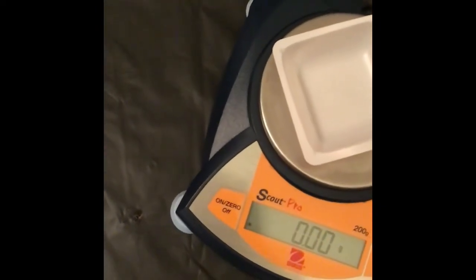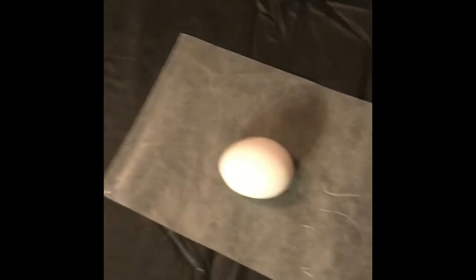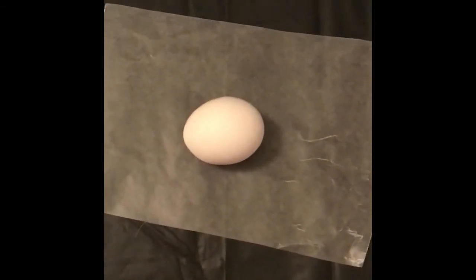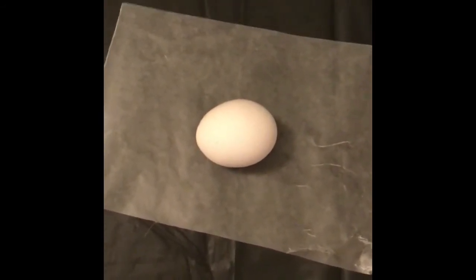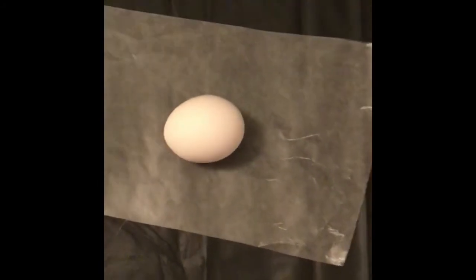We're going to go ahead and add in what it says to do next. If you'll go back to day one, we're completing day one of our experiment, so look at the instructions for day one. We have found the initial mass of our raw egg, and now I'm going to carefully place the egg into a beaker. Here is my beaker, and I'm going to place the egg into it.